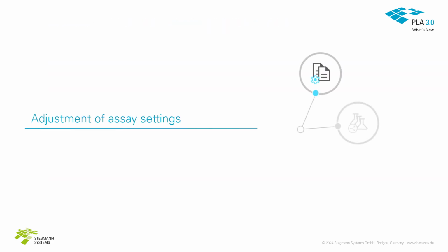Let's now look at the new features of the toolkit for Biological Assay Package version 1.0.0. First of all, it allows compliance-safe adjustments on multiple quantitative response assays, simultaneously. No matter if you would like to optimize a single detail, or standardize the entire analytical method.